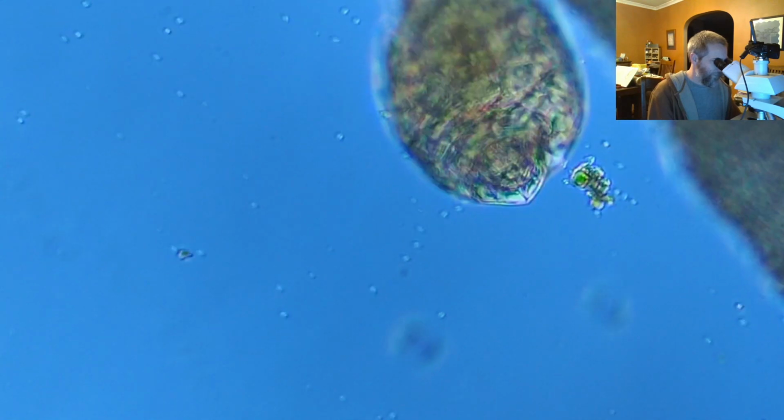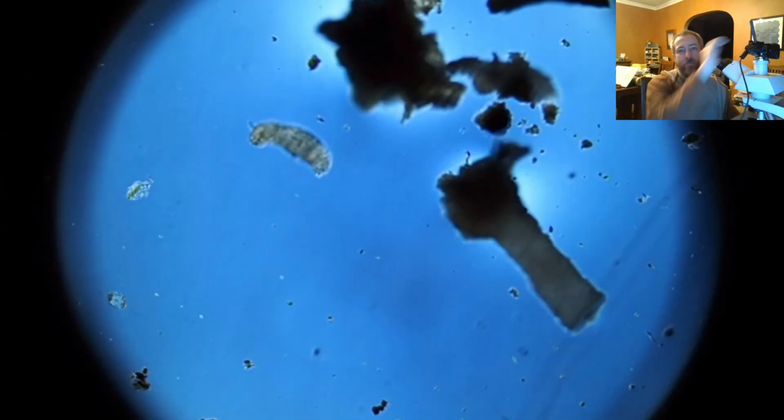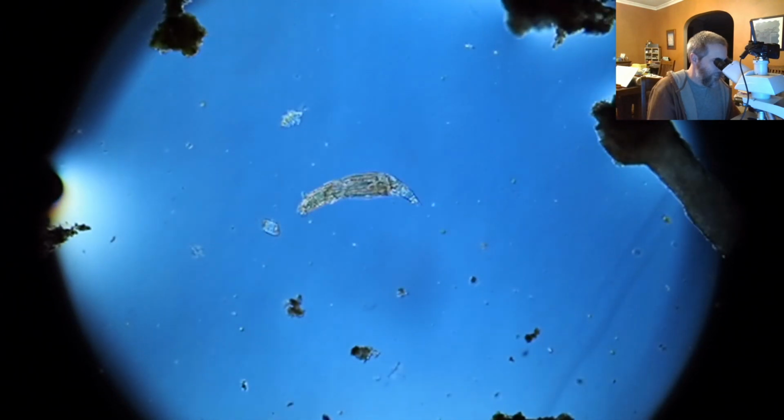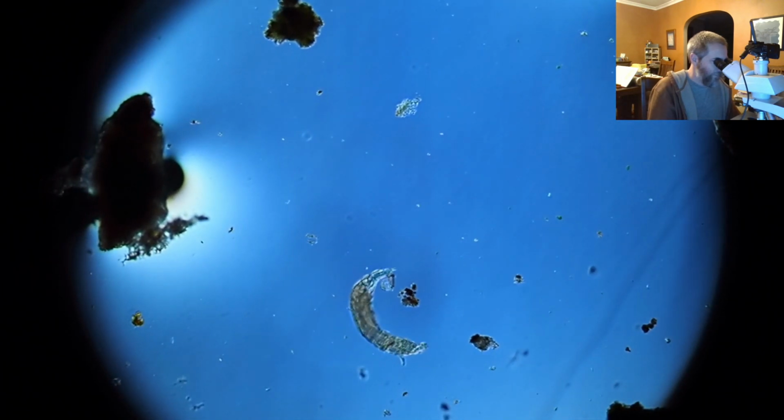Are rotifers and tardigrades friends? Do they play together or do they avoid each other? In what I've seen, they mostly just kind of... Oh, so you can really see the claw right there. Oops, I missed an opportunity to showcase that little claw. You see how it has two little parts that stick out? Oops, I've lost it because of the size, but you can kind of see the claws on the back end of it that it's using to pull itself around. It is grabbing on with its mouth and then yanking itself forward. On that one little back foot, it's got basically two little claws and maybe a third one that it uses to pinch with. But I don't know if they're friends. They don't seem to bother each other much, and I've never seen either one attack the other, so I don't think that they're enemies.